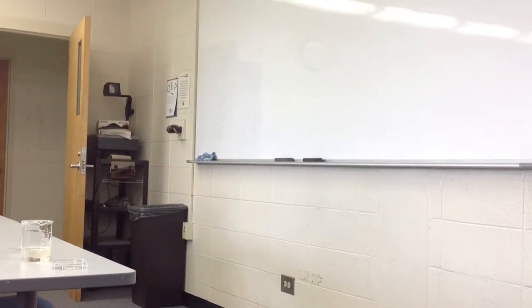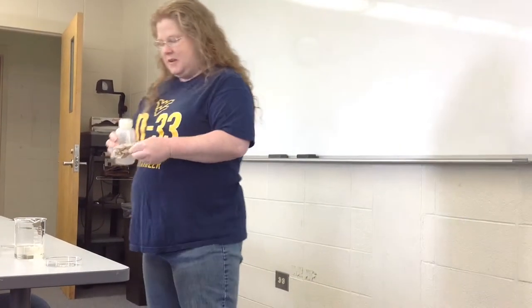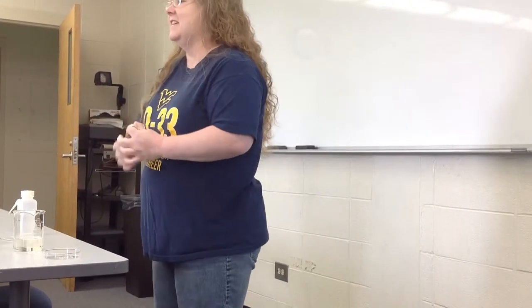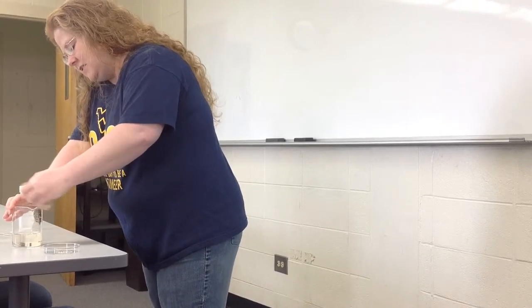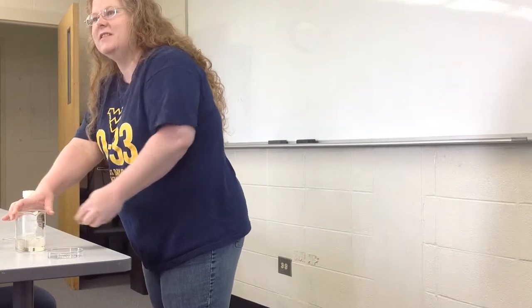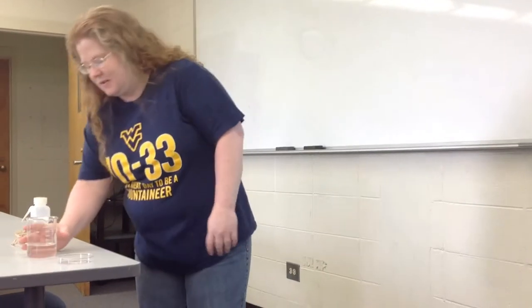One thing I will do before I pour this is make sure that there are no crystals around the lip of the beaker, because if there are, the whole beaker's going to crystallize, and I don't want that. So I will wipe this off and make sure it's nice and clean. You have to use very clean glassware when you do this. It's hard to do. If you're in the back and you can't see, you're welcome to come up closer.